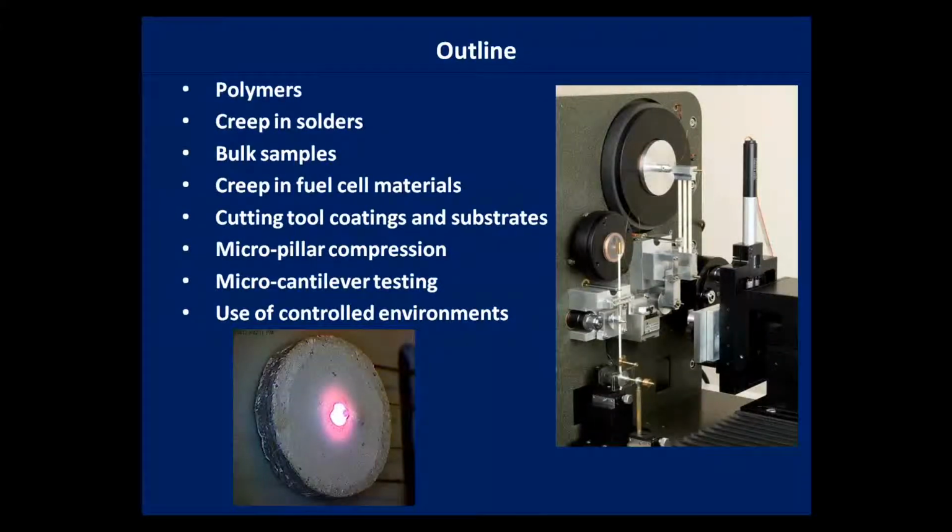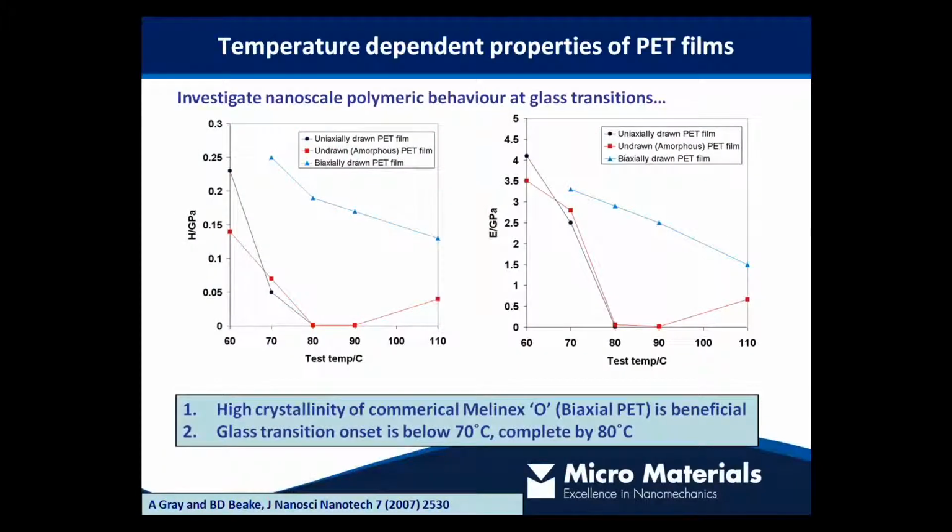I was going to talk a little bit about controlled environments, but Mike's actually introduced that fairly well for us. But I will point out at various points in this talk where the controlled environments have been used. So the bottom left of this screen here, a rather nice image, which is actually courtesy of Maurice Figueiredo, I think he's on the audience list at the moment, of an indenter glowing quite nicely there at 750 Celsius.